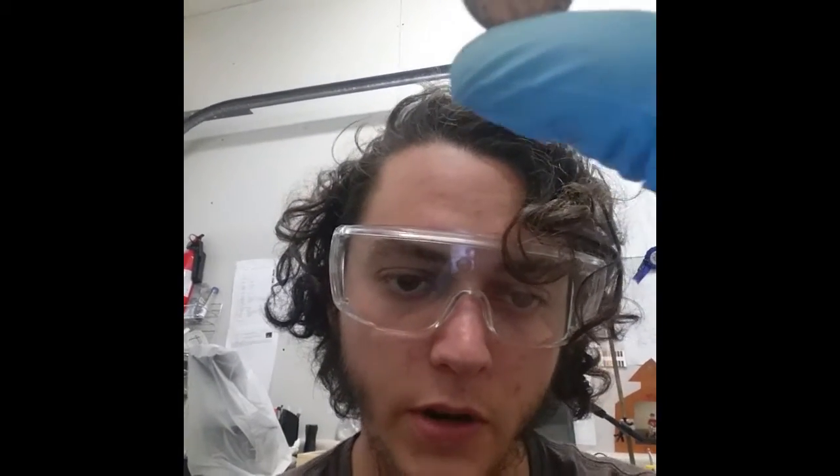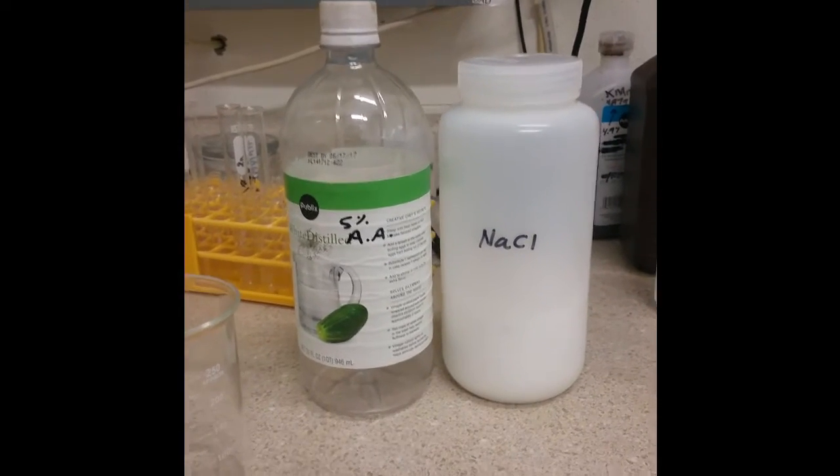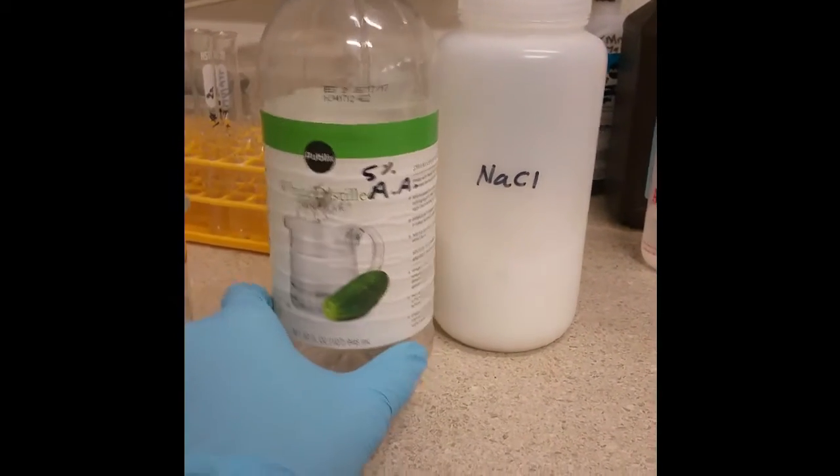By conducting a current through it. The first step is to actually clean the penny, and I figured I would throw in the cleaning step because it's just useful to know, especially if you don't have super clean pennies to work with. So a very useful way to clean a penny is with just your plain old white distilled vinegar, acetic acid, which you can get from any store.